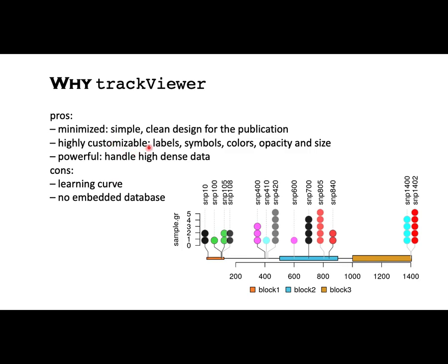There are so many choices. Why TrackViewer for lollipop plots? Just because it is beautiful. It is a minimized design, simple, clean for publication, and it is powerful for high-density data. The shortage of this tool is that you must be familiar with R, and there is no embedded database. That is to say, you need to prepare all the data for plots by yourself.